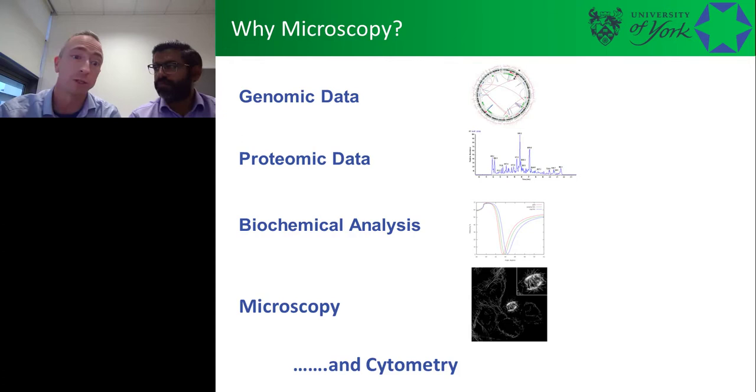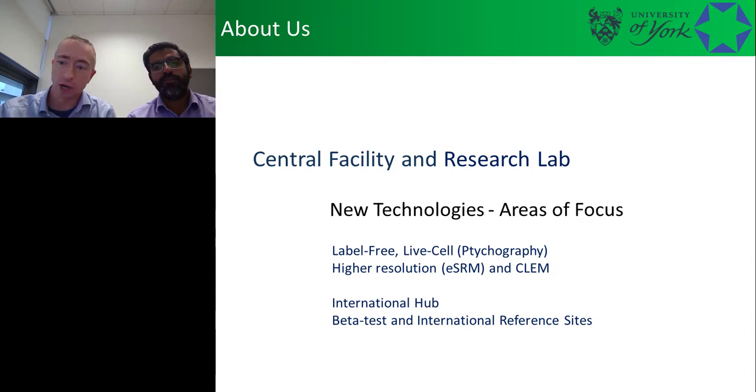So the lab itself isn't just a core facility. We also do a lot of developmental research. We're an international hub for a large African project. We do a lot of beta testing for commercial companies, international reference sites for different bits of kit. But the one area I want to concentrate on today is ptychography, label-free imaging. And we've really been there at the inception of ptychography for live cell science.